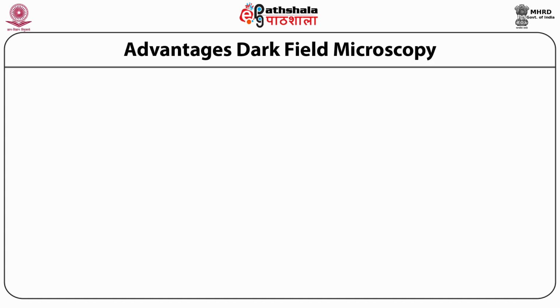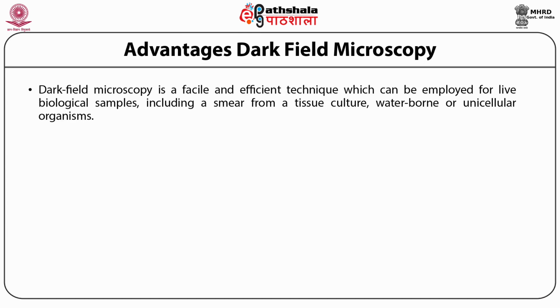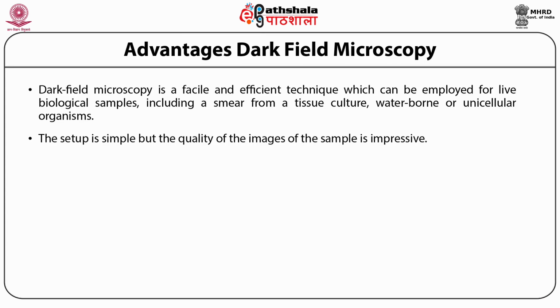Now, let us see the advantages of dark field microscopy. Dark field microscopy is a facile and efficient technique which can be employed for living biological samples, including a smear from a tissue culture, waterborne or unicellular organisms. The setup is simple, but the quality of the images of the sample is impressive.